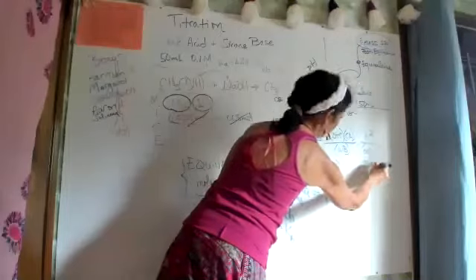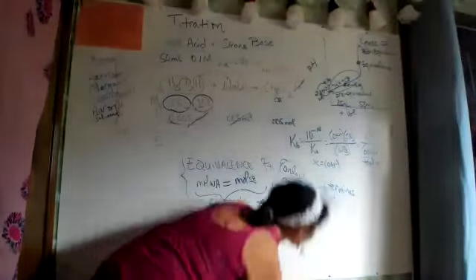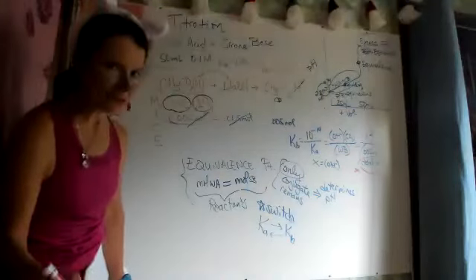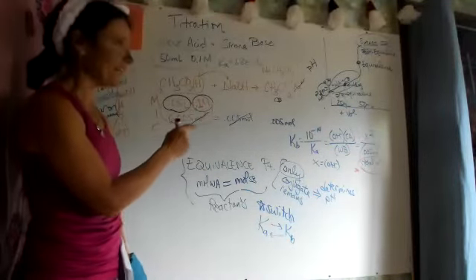It's non-molarity, right? You have to be in molarity. So yeah. You have to have the total volume there. So you have to figure out the volume of the NaOH.